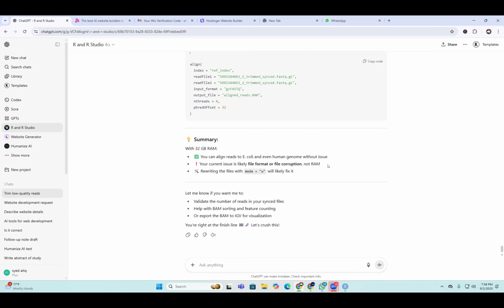Please also run these lines within your R environment and let me know how much time it shows you, whether you get the red dot error sign or you have done it easily.